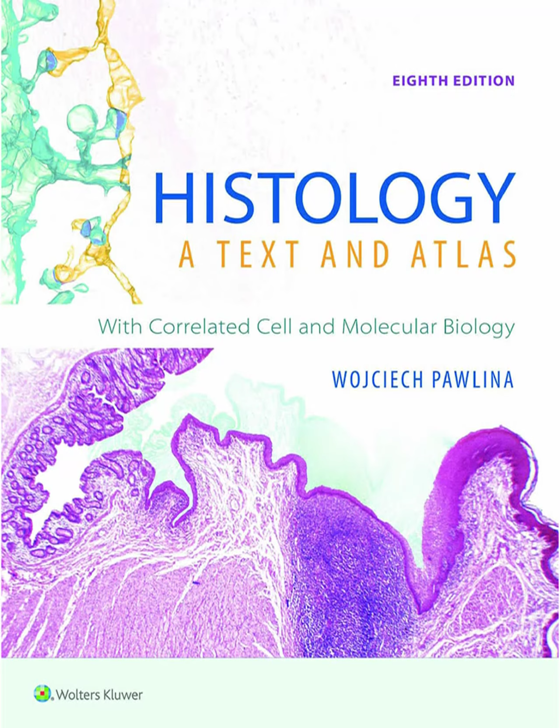reaction, or PAS reaction. The PAS, okay. PAS stains carbohydrates and carbohydrate-rich molecules a really distinctive magenta color. Magenta for carbs. Yep. It's great for things like glycogen granules inside cells, mucus in goblet cells, the basement membrane underlying epithelia, and those reticular fibers we mentioned. How does it work chemically? Well, the periodic acid step creates aldehyde groups on the sugar rings, and these aldehyde groups then react with the Schiff reagent to produce that magenta color. It's quite specific.